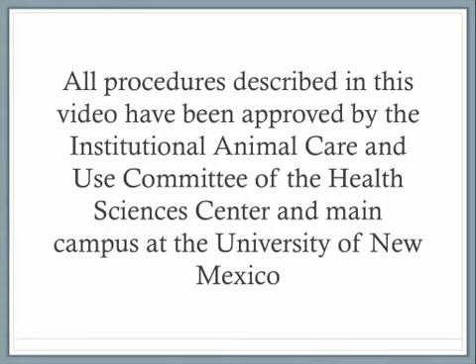All procedures described in this video have been approved by the Institutional Animal Care and Use Committee of the Health Sciences Center and the main campus at the University of New Mexico.